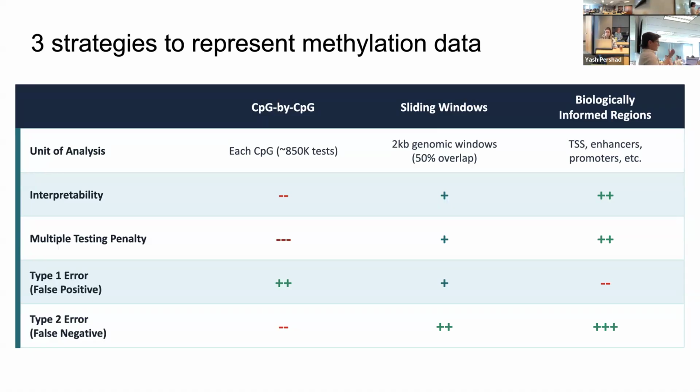Of that, let's say that we get 2 million that are significantly age associated in one of the 3 populations. So that goes through a very rigorous multiple hypothesis testing, or FDR correction. So they're already at that number of CPG sites, I'm looking at a 1% FDR threshold.